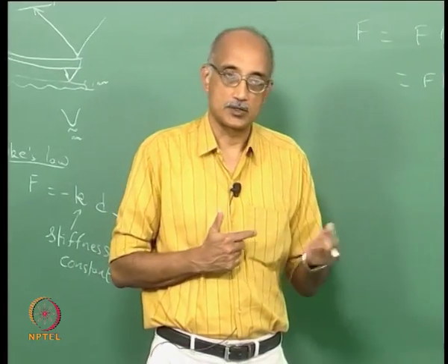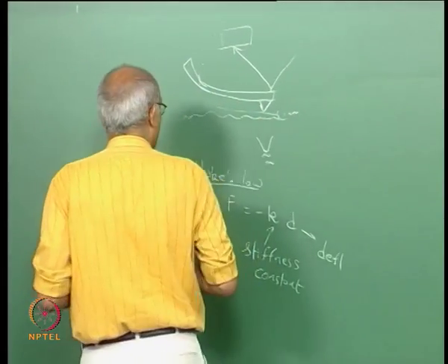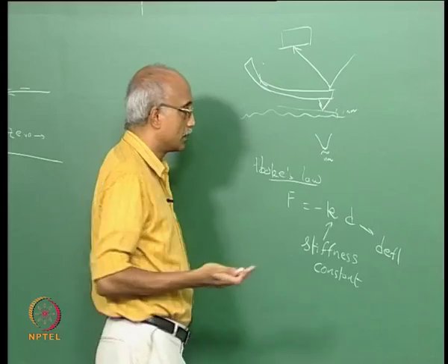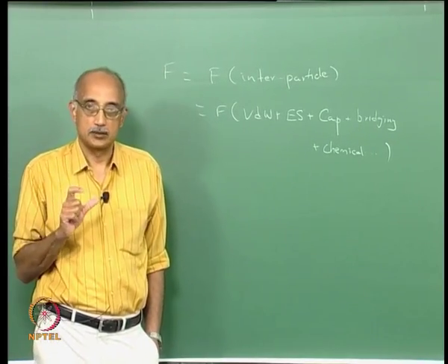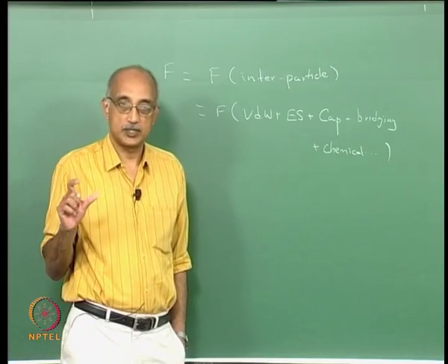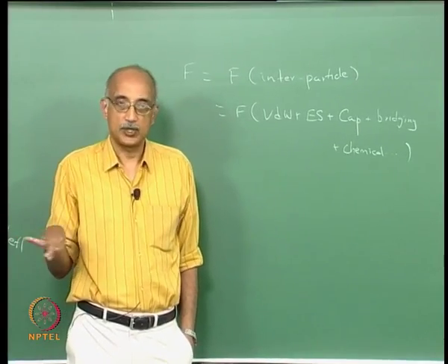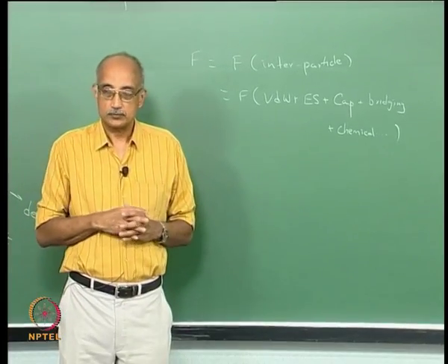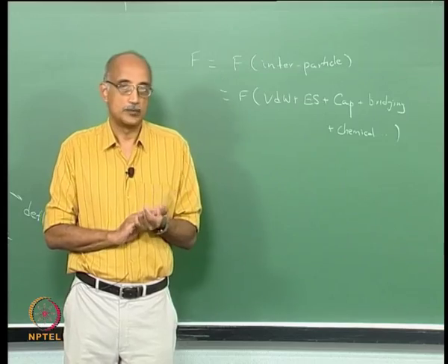How do you use this technique for chemical characterization? Well, the way you can use this is, supposing you have a surface that has a certain profile, and let's say that there is also a compositional variation on the surface. Now, as you know, all these forces are also dependent on the nature of the material. For example, the van der Waals force, if you recall, is related to the Hamaker constant, and the Hamaker constant is very much a function of the material. So, these forces are not going to change only because of physical variations in your sample, but also because of chemical variations. So, you can actually distinguish two chemical elements that are adjacent to each other simply by looking at the force that they impart to this atomic force microscope probe. So, chemical characterization also becomes possible.